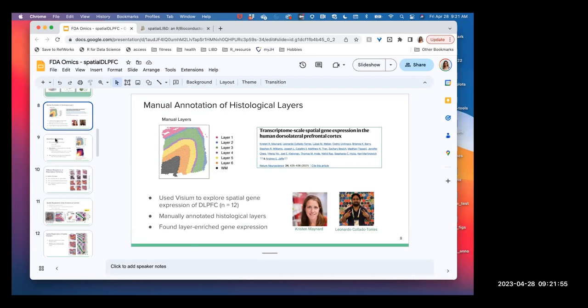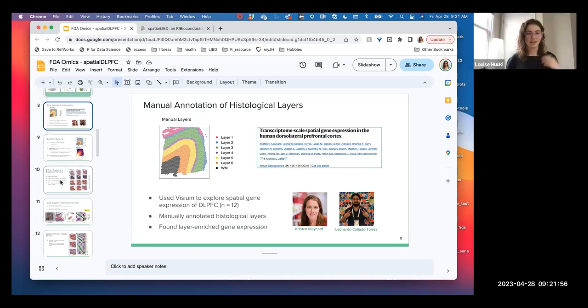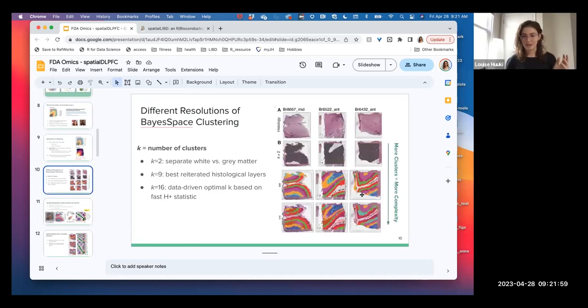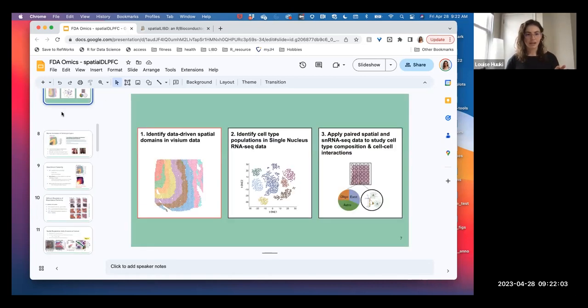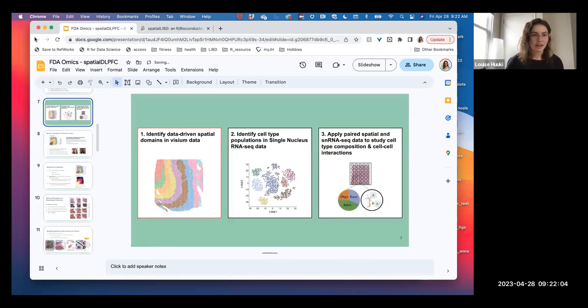There are 12 of these sections that have the same type of data that we can use all together. And then in the new project we have 30, so it's like different slices of brain.